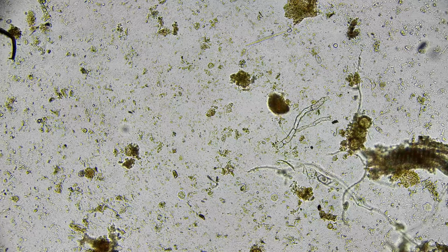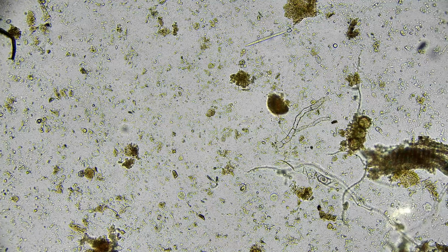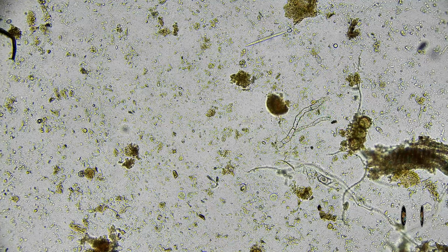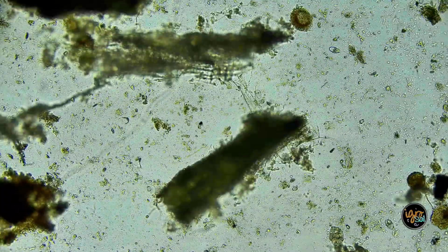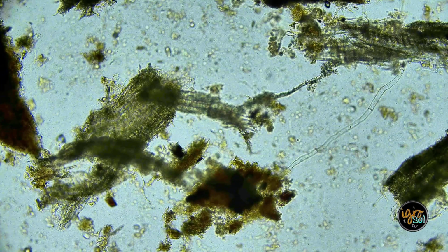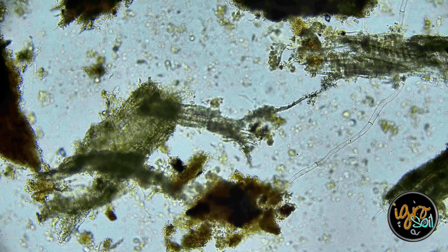If it's fungal, it's got septa, right? We're looking at these separations in it right here, right here. So I won't try to guess. I'm going to move quickly through this. That's got to be fungal. Look how wide that is. Dang.